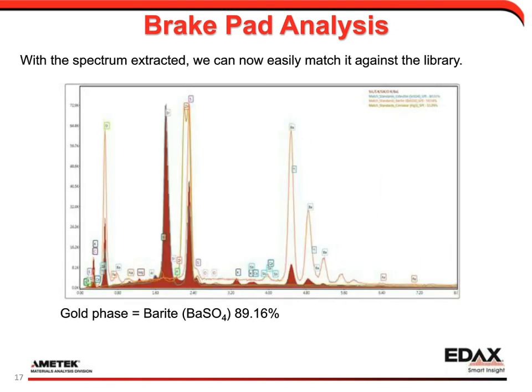We look at the brown phase and do the same thing. We get celestite. And if you remember what I showed you before, we saw strontium, sulfur, and oxygen, and the reason why we are not getting 100% is that we have other trace elements in here as well. We thought there was some silicon and potassium when we were looking at the map overlays. But in general, this matches up quite well with celestite.